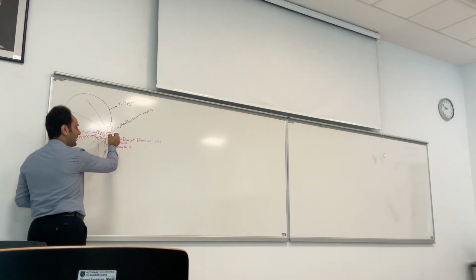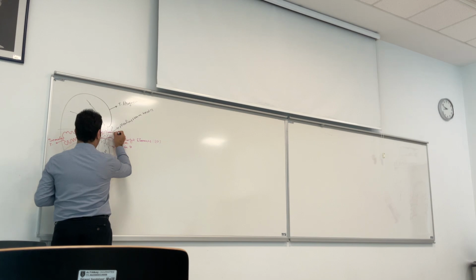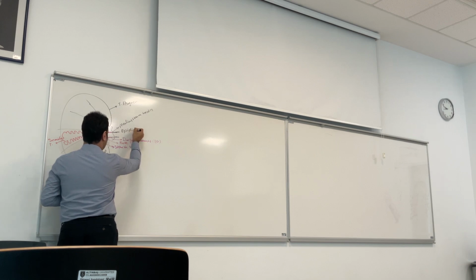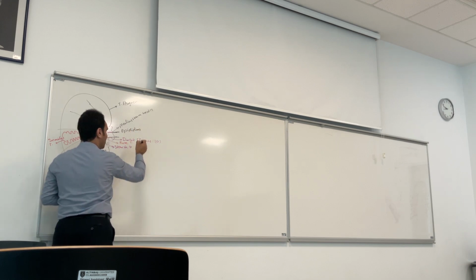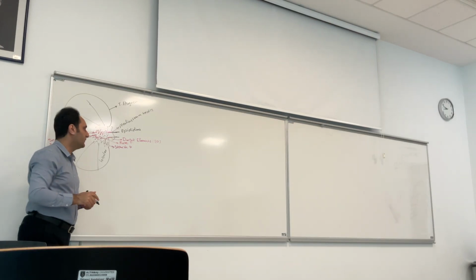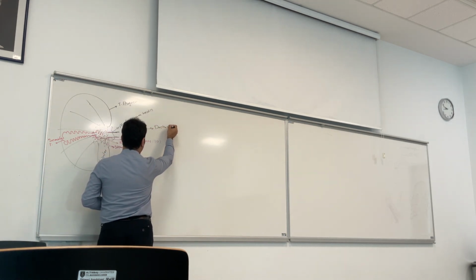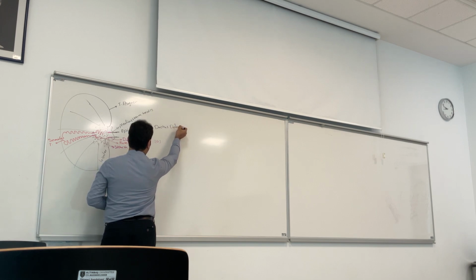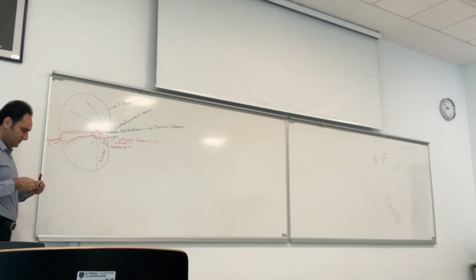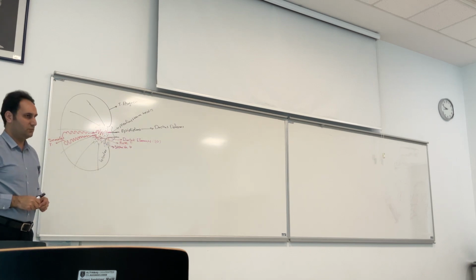These ductules connect with the head part of the epididymis. And as you know, the epididymis continues with the ductus deferens.